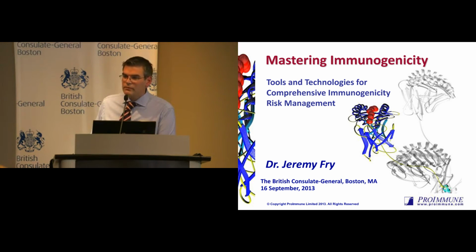What's the level you're trying to compare to that? Is it just to the CAMPATH level, or is it known about that? Good questions. So first of all, with the DC-T cell assay, you were talking about the levels of presentation of that drug. Well, we're looking at the amount of class 2 that's expressed, but we haven't measured that in the context of comparing it to different drugs.